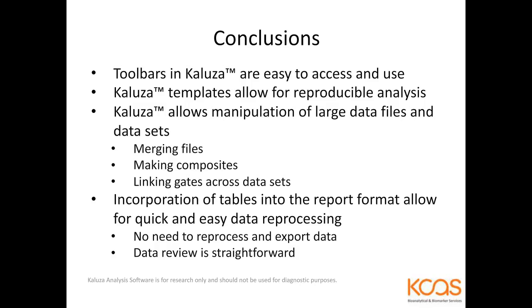We covered creating templates and using them in a reproducible fashion for analysis. We talked about manipulating large data files and data sets. So regardless of how many statistics I pile onto this thing, the templates open up, they repopulate, I move a gate, it updates my statistics. I have a profound ability to crash software and break things, and it's tough for me with Kaluza to find a way to break it. I've done it once or twice, but they've troubleshot right through it.